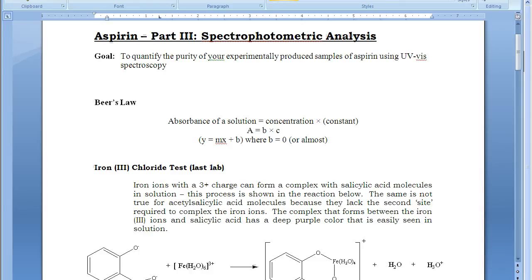This is the third part of our three-week aspirin experiment, and the goal of our final work is to quantify the purity of our experimentally made samples of aspirin. To do so, we're going to use ultraviolet visible spectroscopy, UV-Vis spectroscopy.